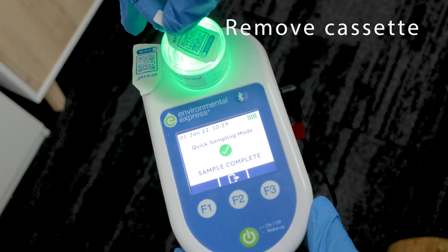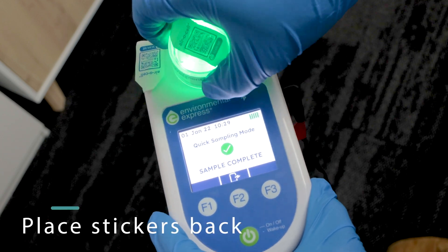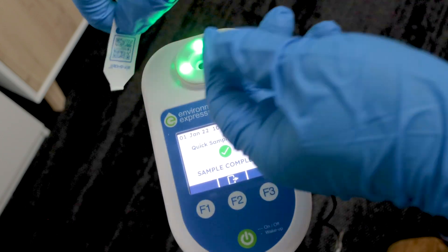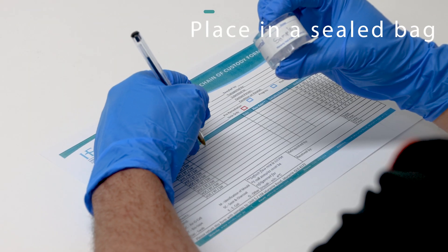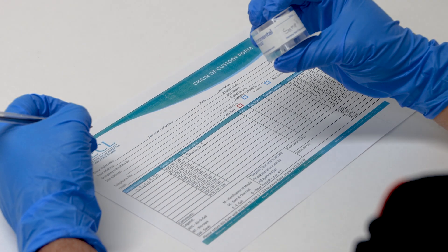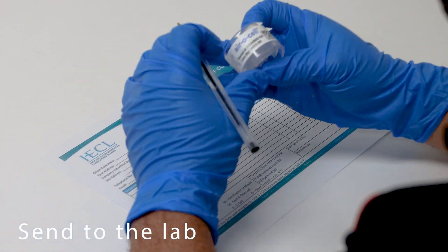Select the duration of the sample and let it complete the test without moving the machine. Once completed, remove the cassette and place the stickers back on each side of the cassette. Repeat for any other sample you need to take. Once completed, place it into a sealed bag with a chain of custody form and have it sent to your lab for testing.